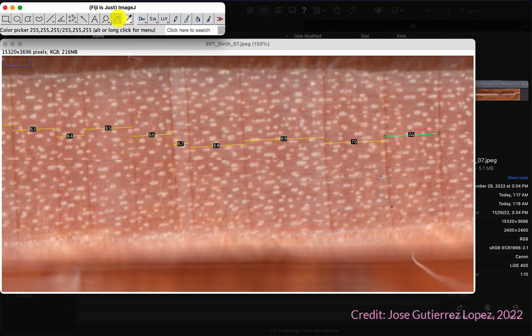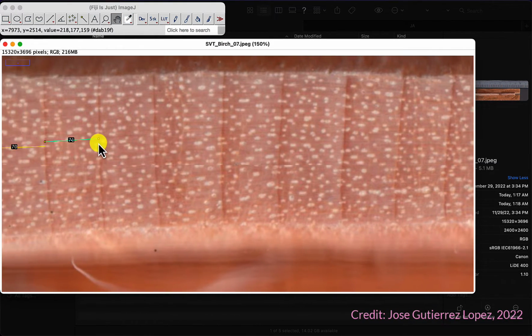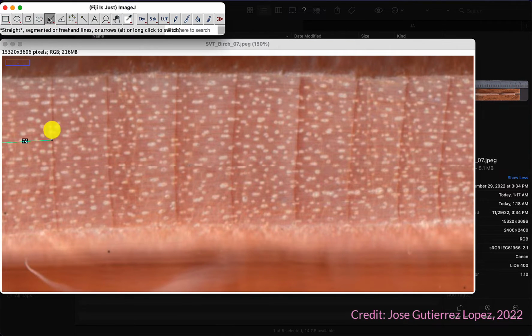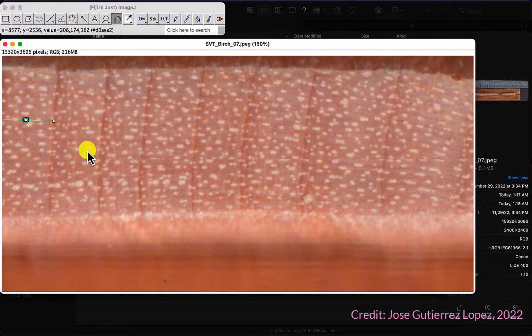Either someone knows that there was a fire or beetle infestation, or you can detect anything really, as long as that specific tree was affected. Something that we've learned here in boreal and also other forests is that not every tree will respond to, for example, drought or something. Every tree is unique.